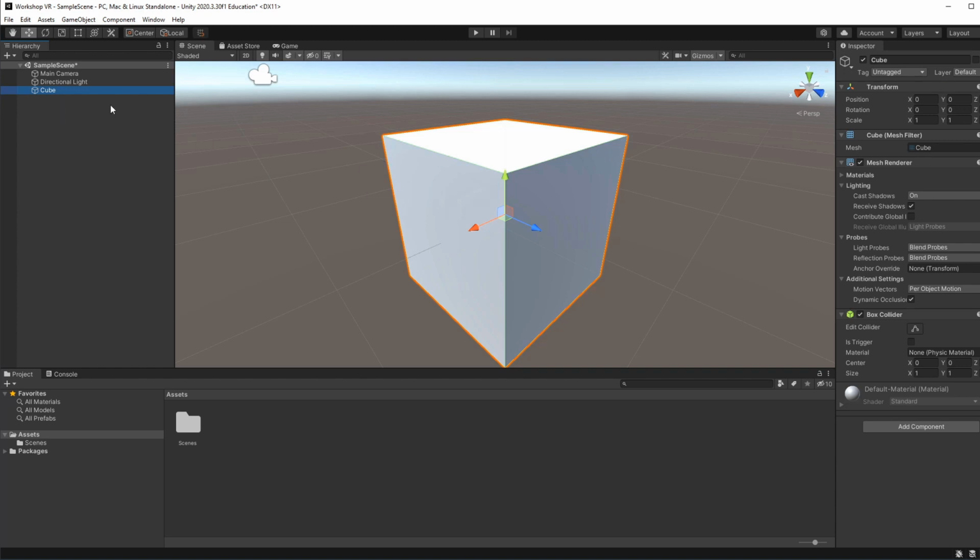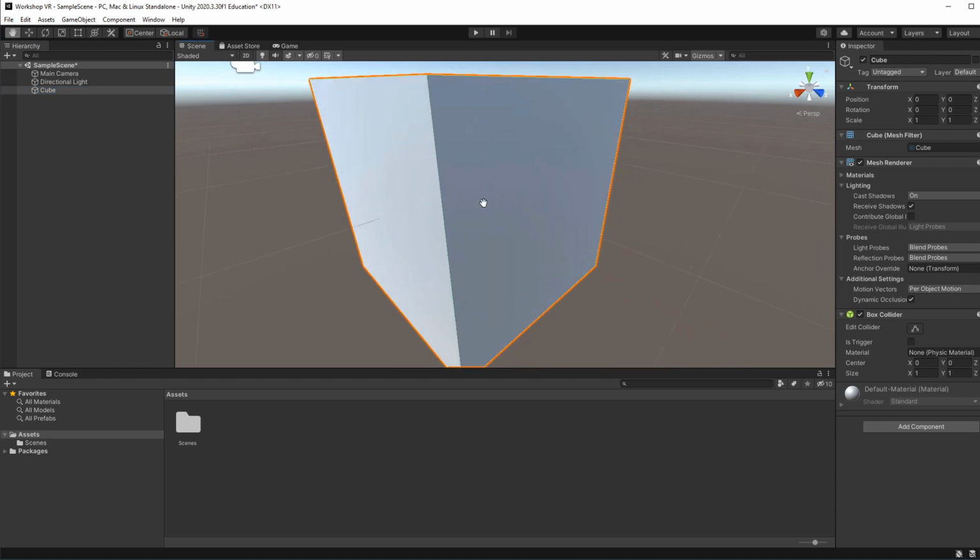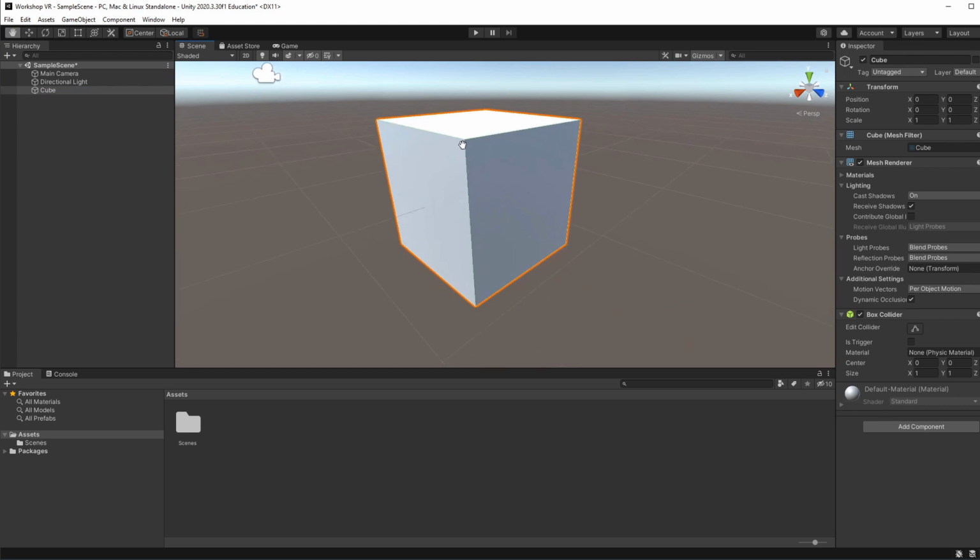This is a little bit similar to the project view and the properties view of Avizo, if you remember. Okay, so as I mentioned, everything in Unity is a game object, or all the items that you can add to your scene are game objects. And your game objects can have components, as you can see here. A component would typically be some sort of feature or capability that your 3D object can have.